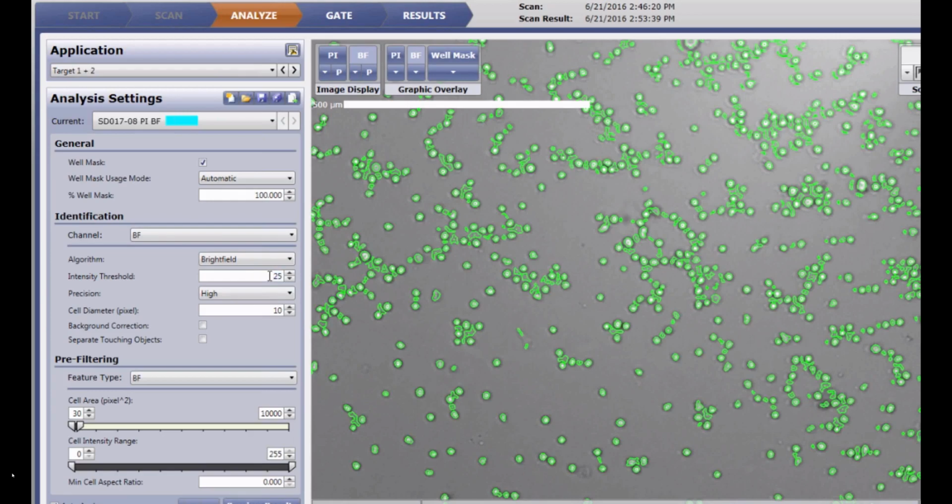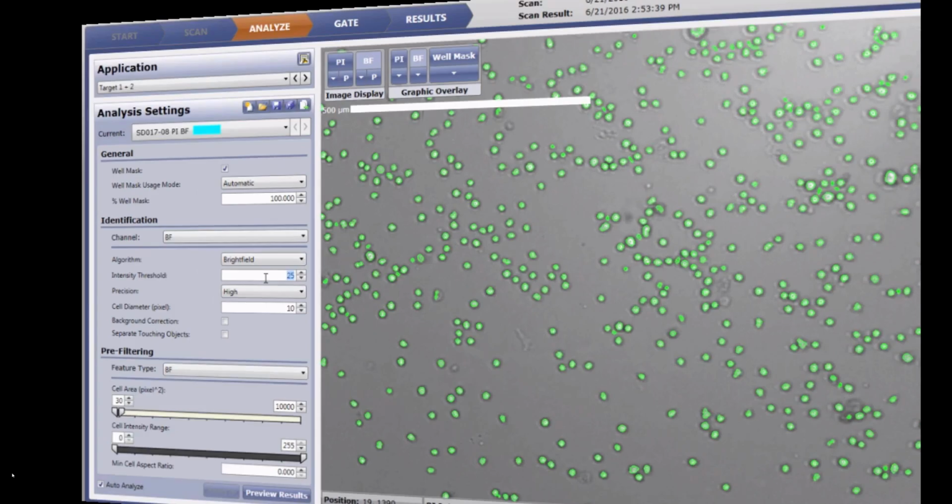And if you wanted to record these values to try it out right off the bat on your cell lines, you can do that, because this is typically what my suspension cells will always look like, and the adherent cells you saw, those usually are what I'm seeing as well.